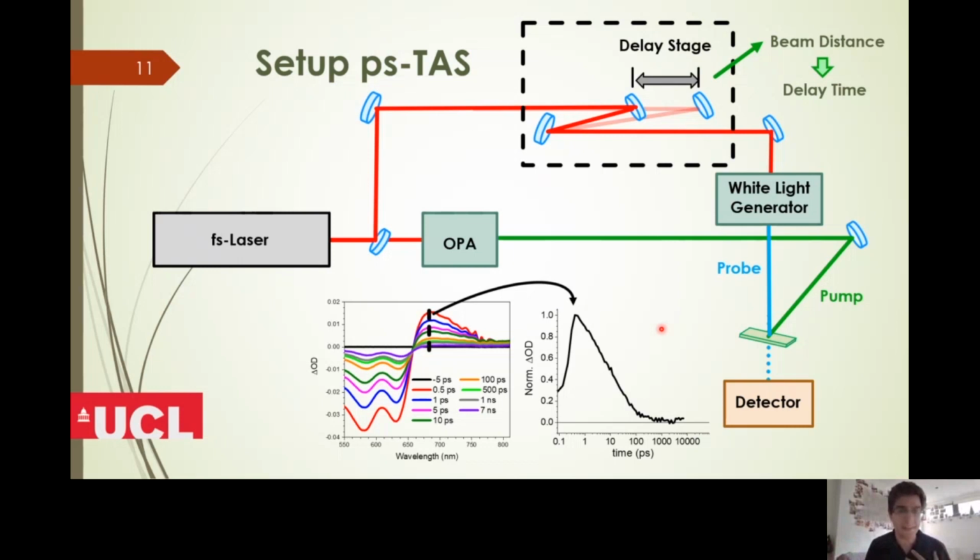You wouldn't be able to see your different species, and this is going to be your lower threshold for the measurement. In most cases, these femtosecond lasers have about 100 femtoseconds pulse width, so you're not going to be able to measure less than that.